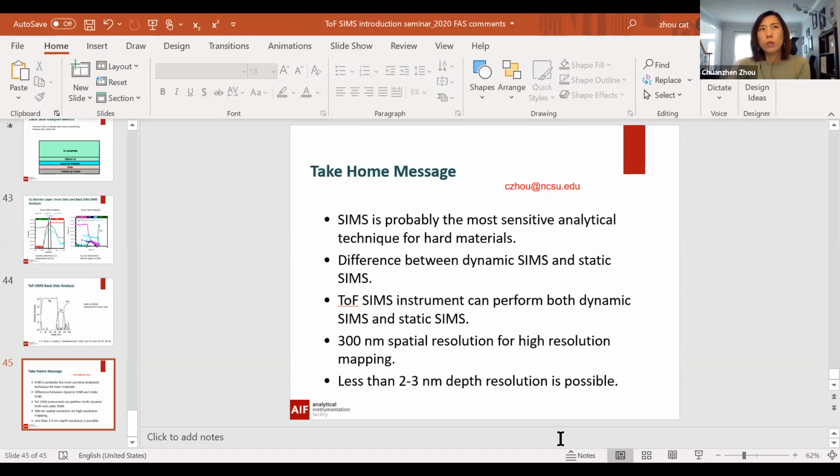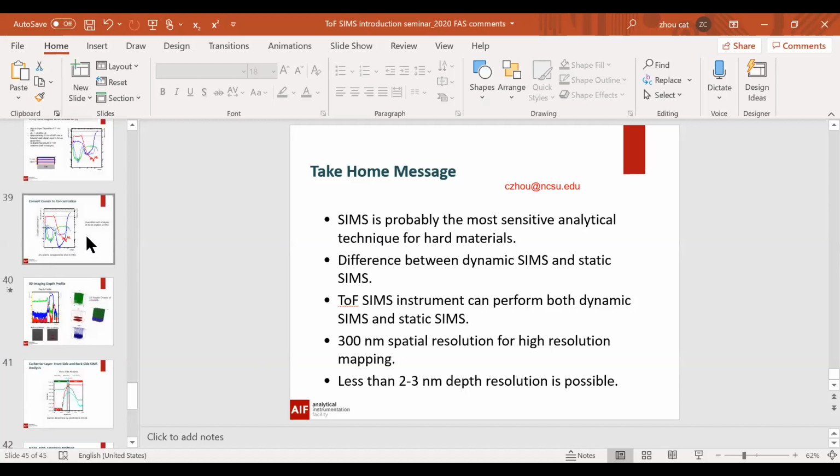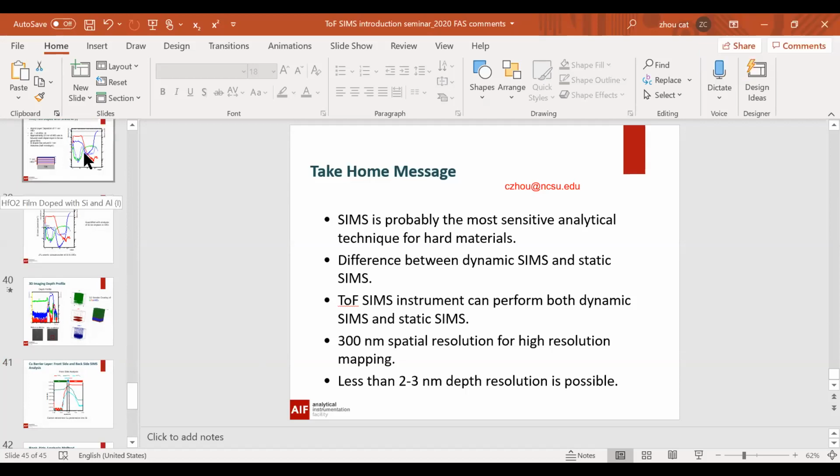Yeah, I think the main difference for me with the different energy is that lower sputtering energy gives a much better depth resolution, but a much slower sputtering rate. Yeah, there was a professor here at the U of I, Ed Seebauer, who was using low energy to get very, very surface sensitive depth profiles. Very surface sensitive means within 5 nanometers. Yeah, very, very close to the surface.